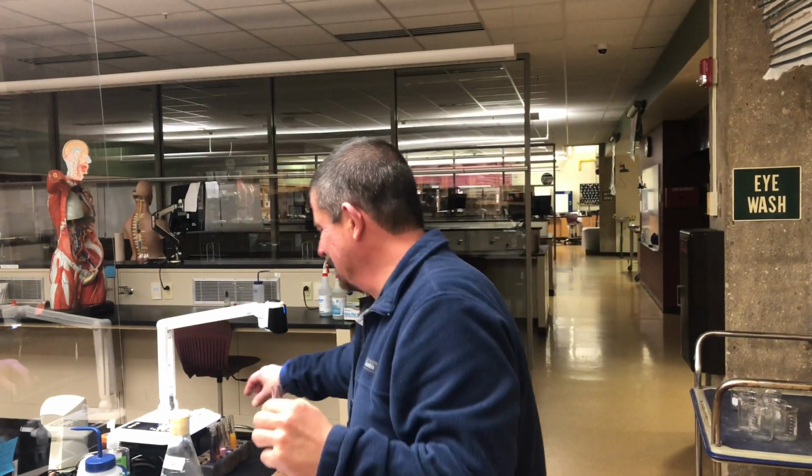So we have to take both test tubes and put them in a warm water bath, because we need to heat up the solution so that the Benedict's will react with the sugars in the solution.